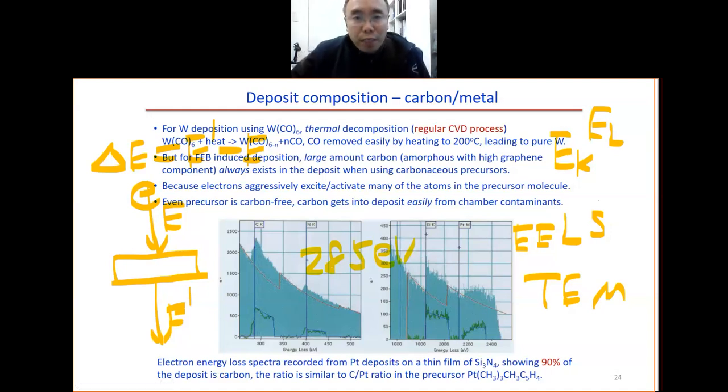We have seen previously that another particle can also do the same thing. What is that? We can also use X-ray to kick out an inner shell electron. The difference is that for the case of electron, it loses part of its energy.